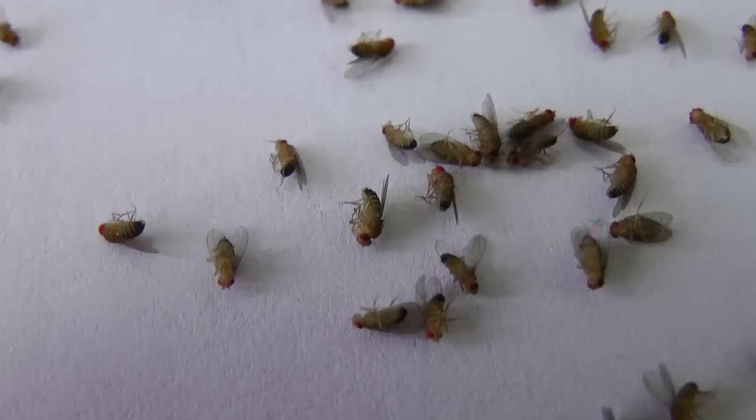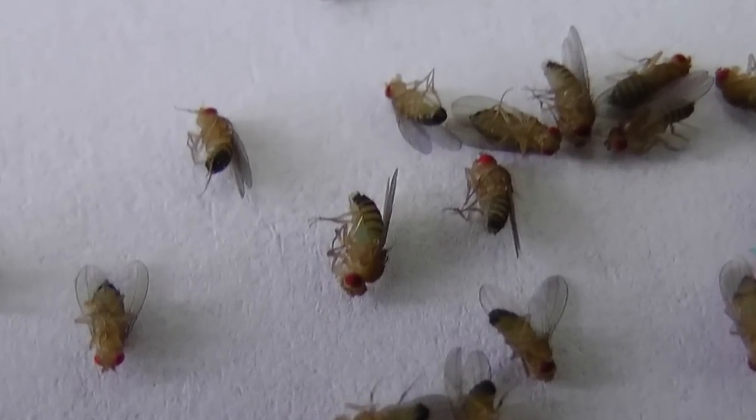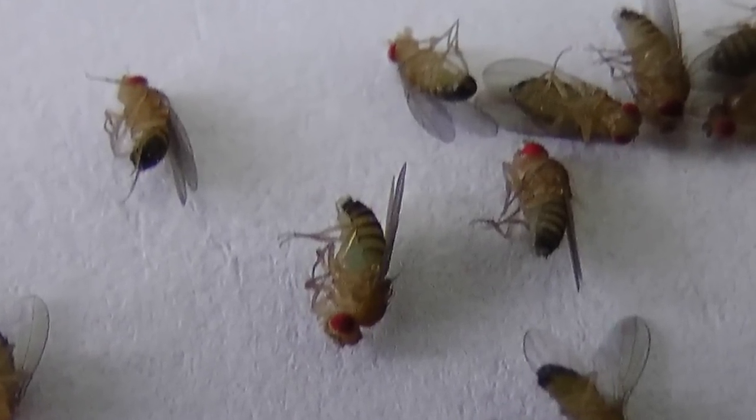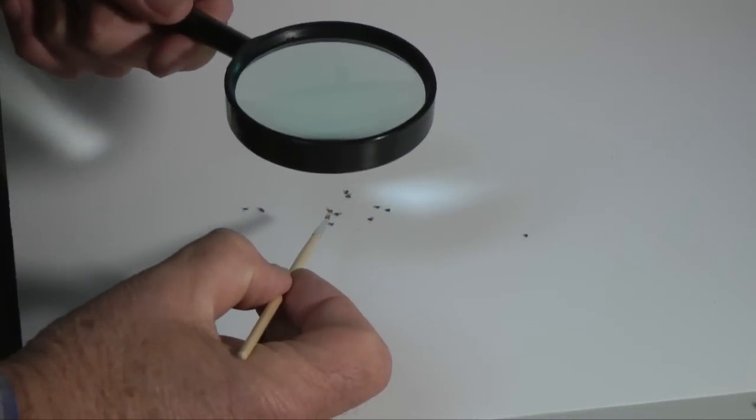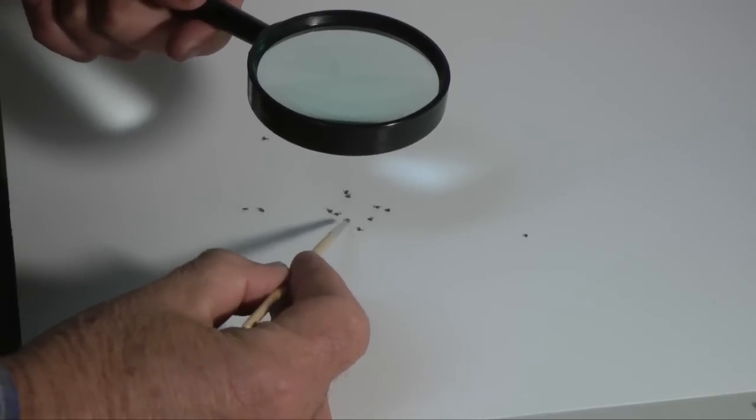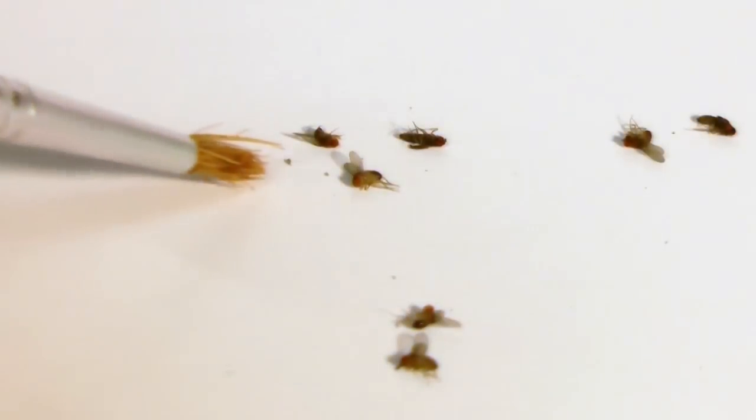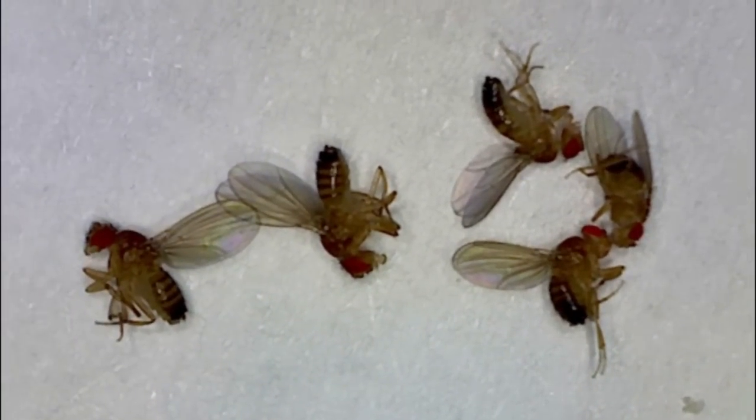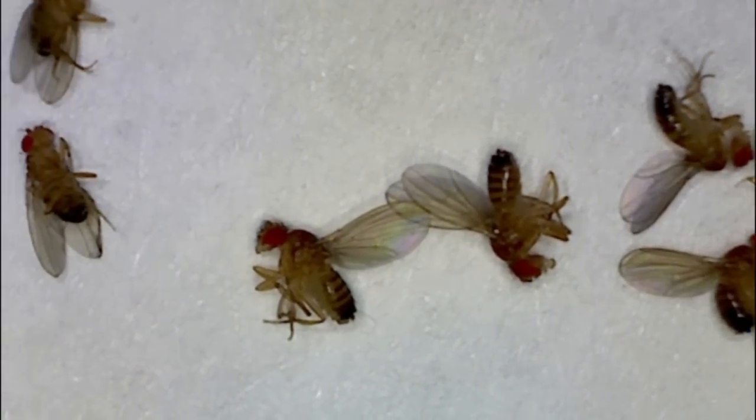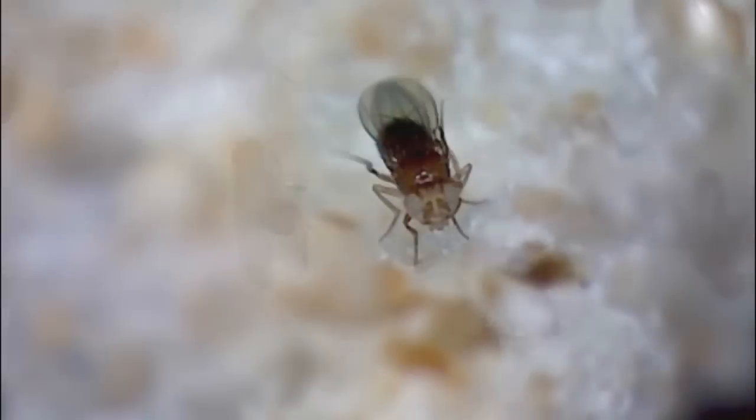These flies are the first generation from the white-eyed male, red-eyed female cross. With a small brush and hand lens, sort the flies by eye color and sex. If your results are the same as Morgan's, all the flies have red eyes. The white-eyed trait seems to have disappeared. Or has it?